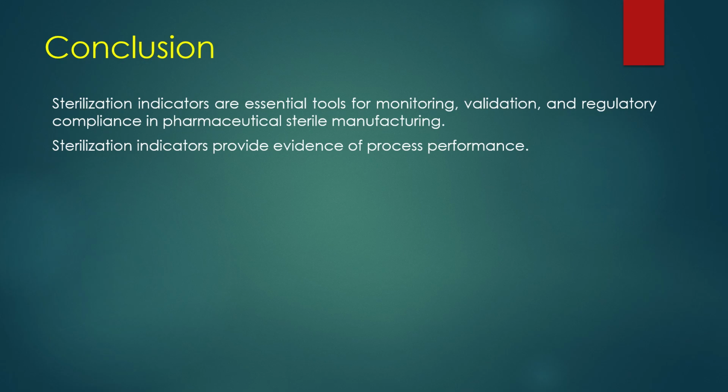Conclusion. Sterilization indicators are essential tools for monitoring, validation, and regulatory compliance in pharmaceutical sterile manufacturing. Sterilization indicators provide evidence of process performance.